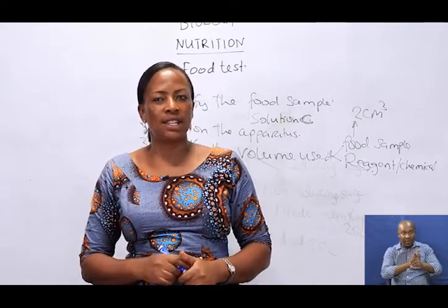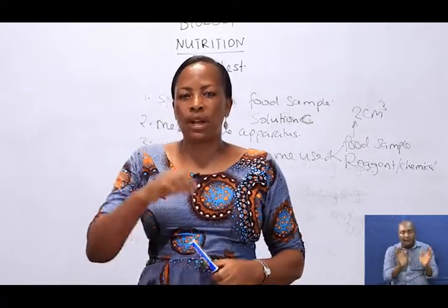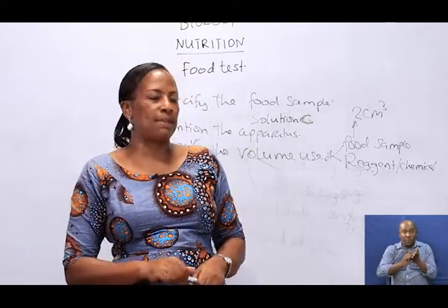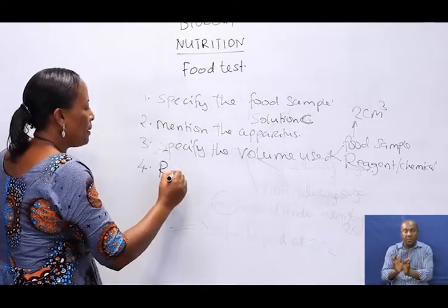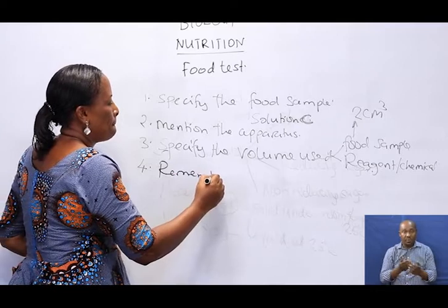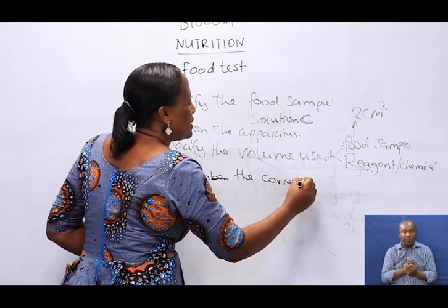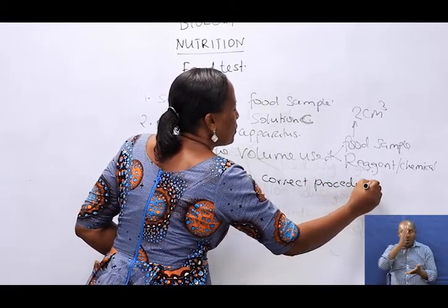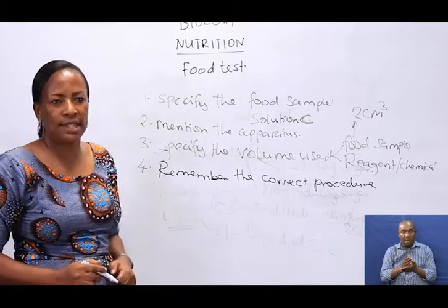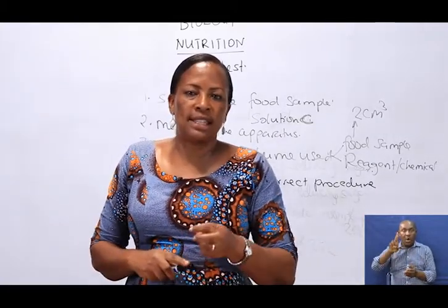There are some procedures where students should allow the material to settle for some time. Now, that is to abide by. So remember the correct procedure during report writing. Correct procedure. Remember to include those things.